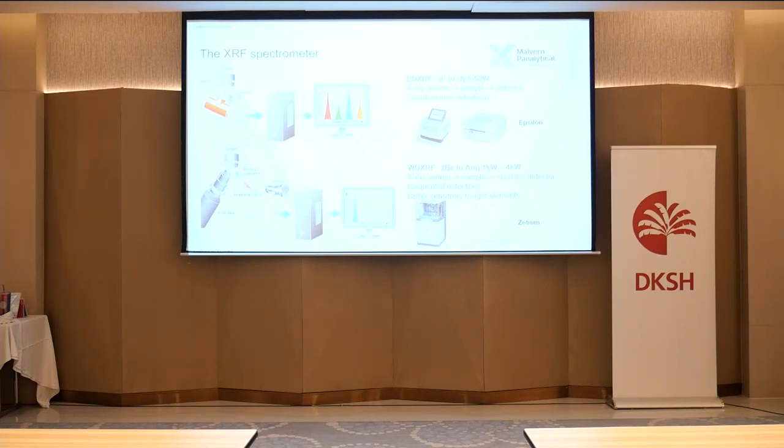So this is slower than ED, and that is why, to make it faster, you need higher power. Usually WD-XRFs are higher power, from 1 kilowatt to about 4 kilowatt.